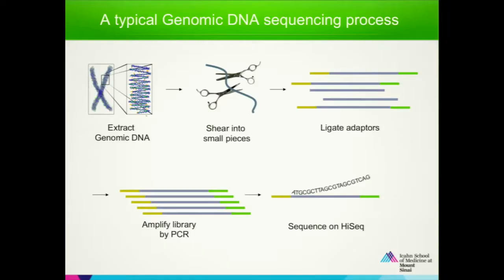If you are sequencing the entire human genome, what is simple? Take the human genome, break it into pieces again. People are asking me how to do that. Put adapters on both ends, amplify those, and then sequence them, layer them on that slide, on that one lane, and then sequence it, align that sequence, go over into bioinformatics, and then get your entire human genome, and then study its variation.